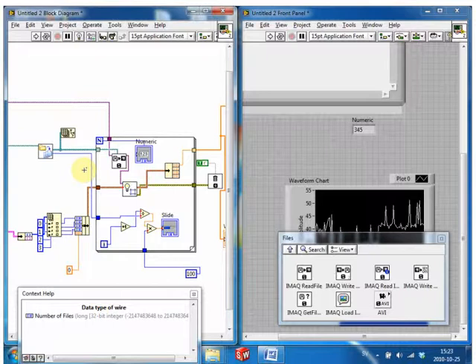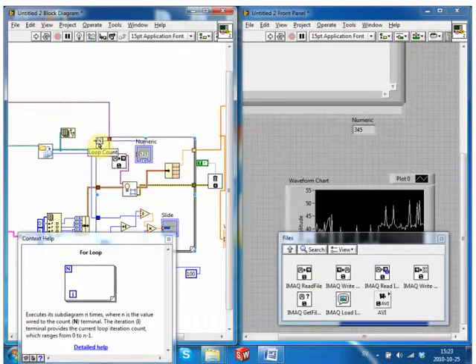So you can do for loops on defined data sets. It's quite common that you might have an array of data, but the actual thing in the loop requires the whole array, and you have to pick points from within the array, so you need a different value. There are lots of times where the array might actually be an image, so you obviously don't want to index an image pulling it into the loop. So you switch off the indexing as it goes into the loop, and then you index the array within the loop. But anyway, it seems to work.